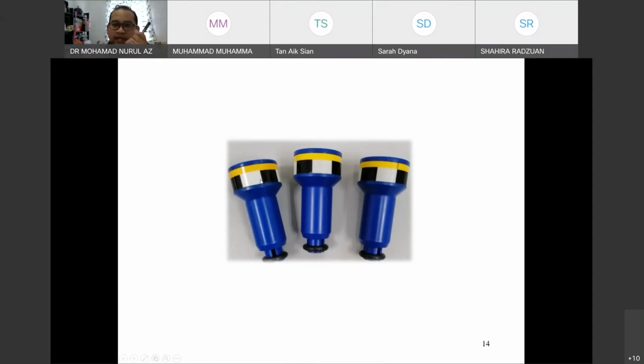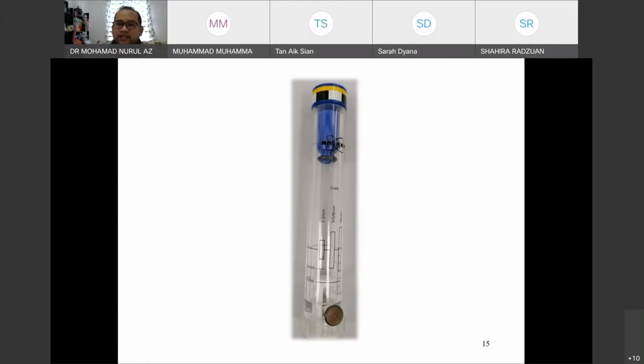Yellow is 1, black is 0, and these calculations tell how fast the sample spins inside the probe.